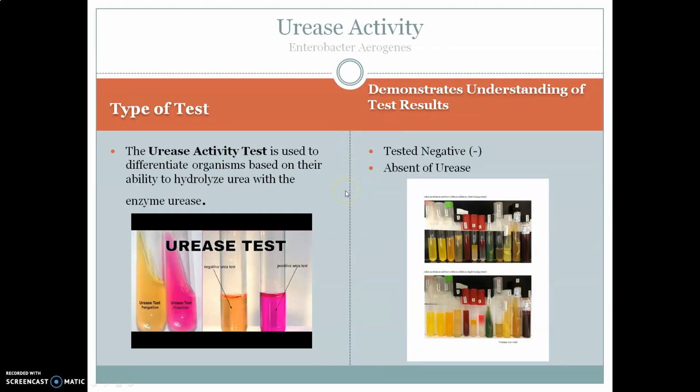The next test I looked at was the urease activity test. This test is used to differentiate organisms based on their ability to hydrolyze urea with the enzyme urease. My unknown tested negative for this.